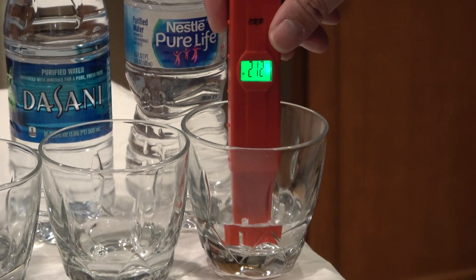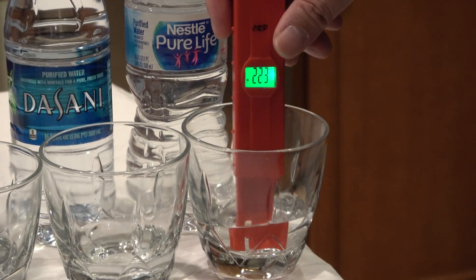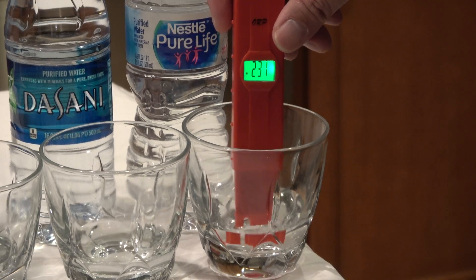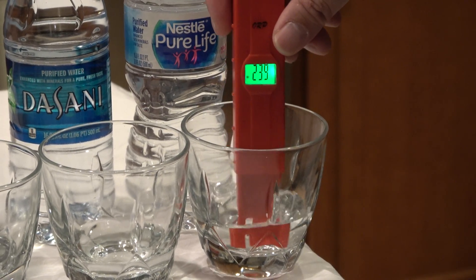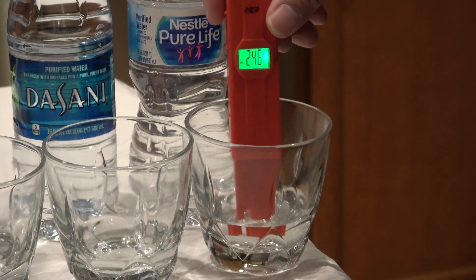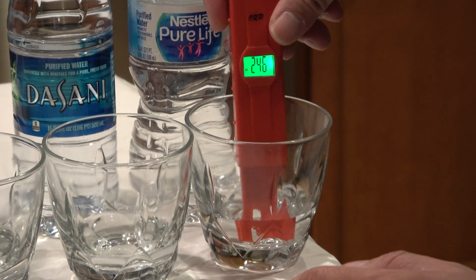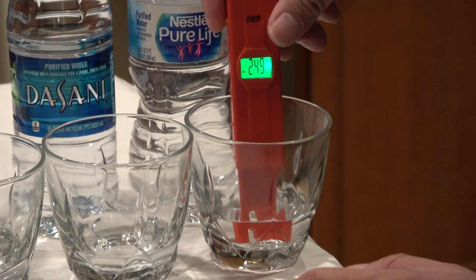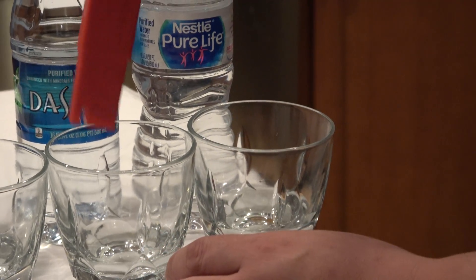So right now it's about 200... 230 and climbing... 240. There's no negative sign so it's a positive 240, 250 — climbing. Now we're going to test the Sunny water.